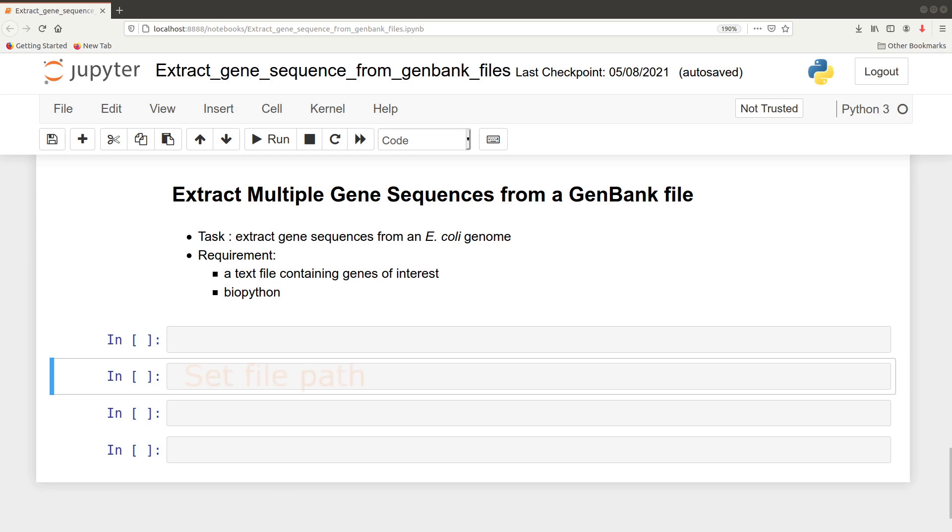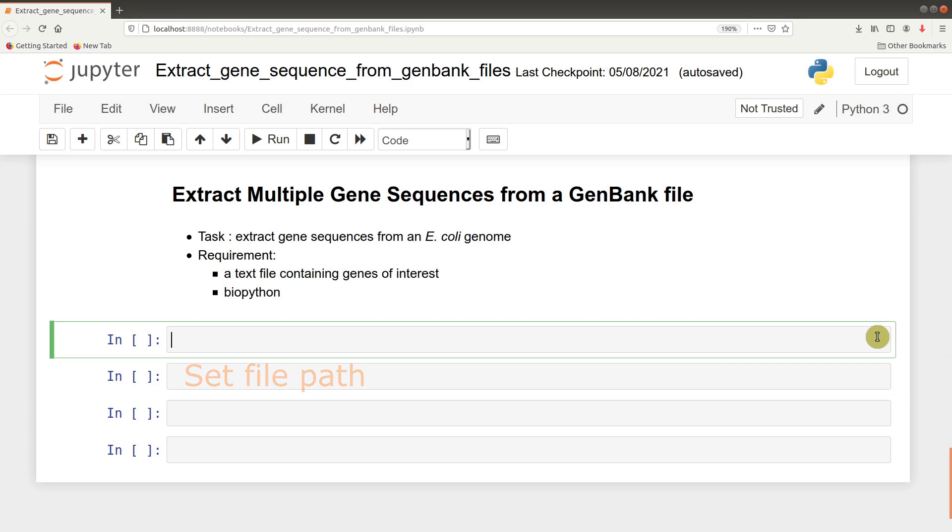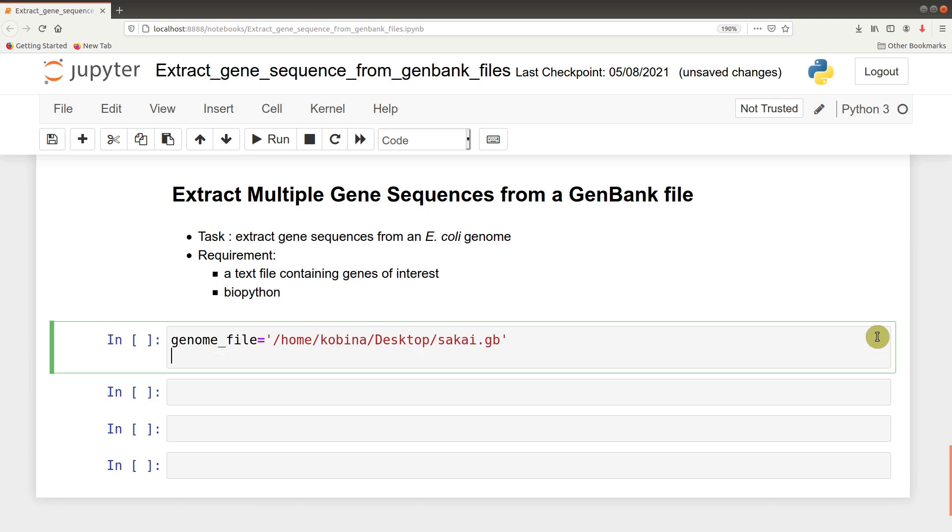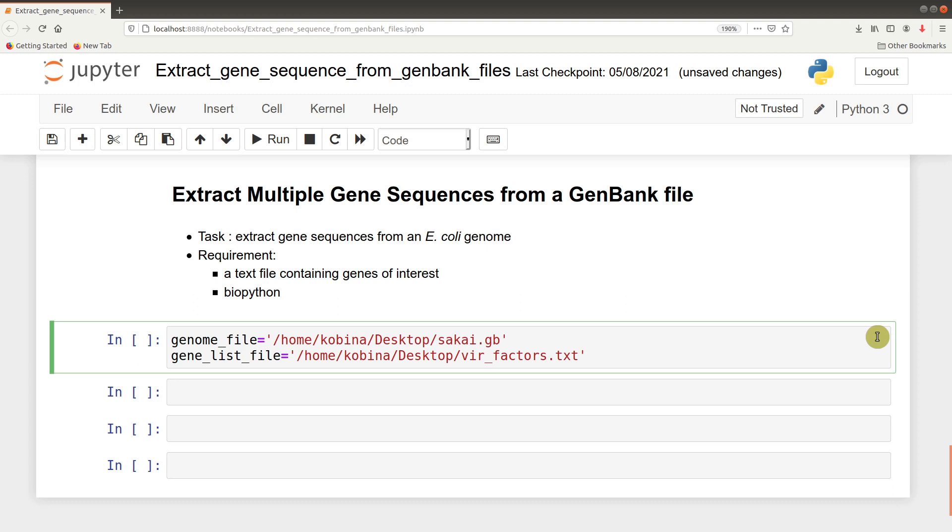On the Python terminal, the first thing we will do is to set the path to the genome and the text file that has the gene names. We start with the genome file: genome_file equals this path, and then the text file: genlist_file. Take note that the path is likely to change on your computer, so make sure you put the correct path there.